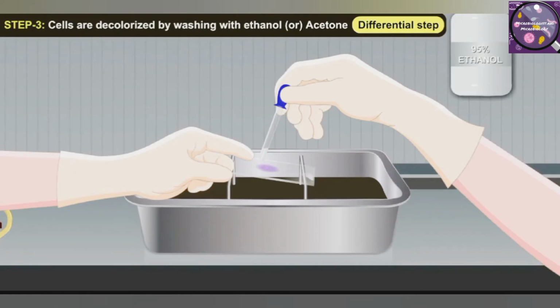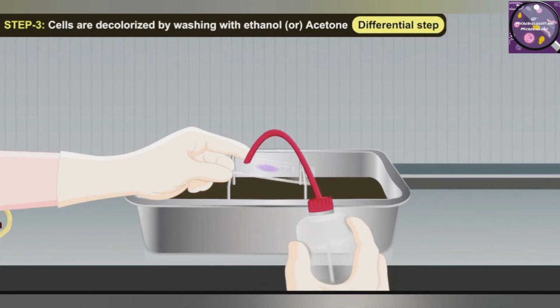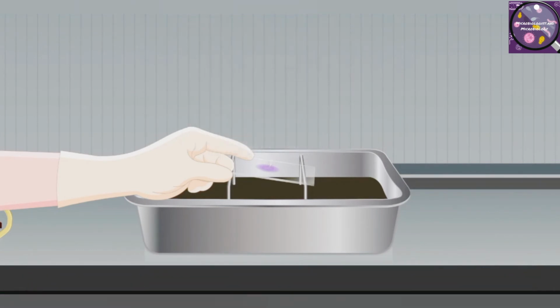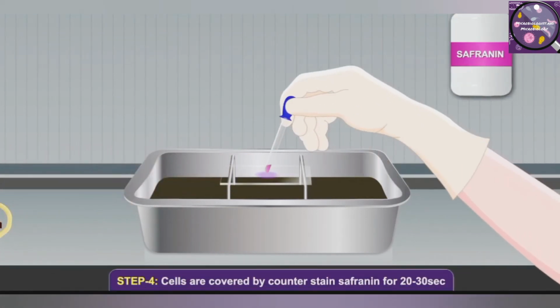Gram-positive cells can lose the crystal violet-iodine complex during prolonged, excessive decolorization. Excess ethanol is then washed off with water. Under the microscope, gram-positive cells appear purple and gram-negative cells are colorless.